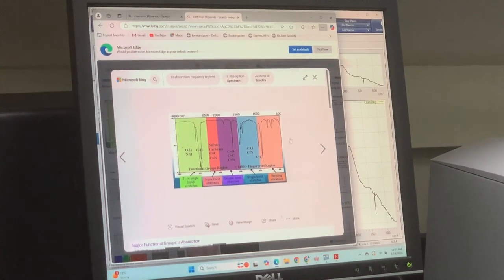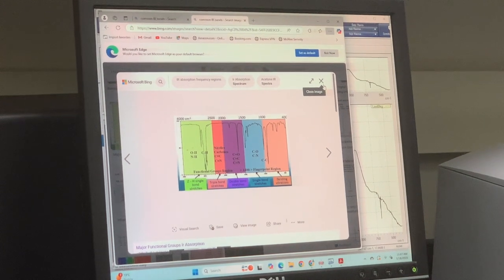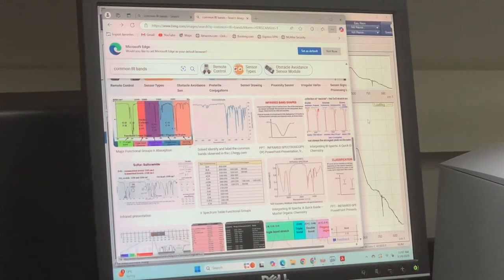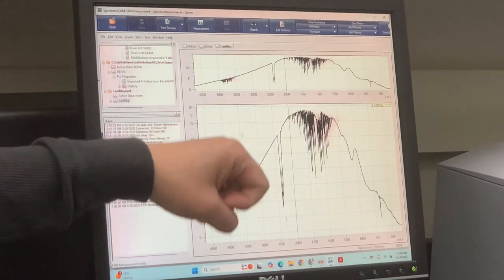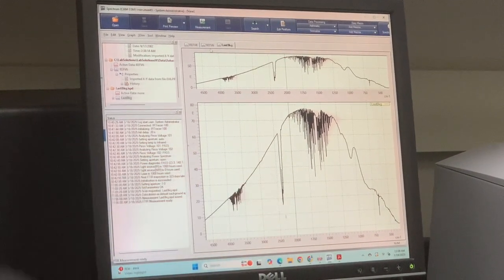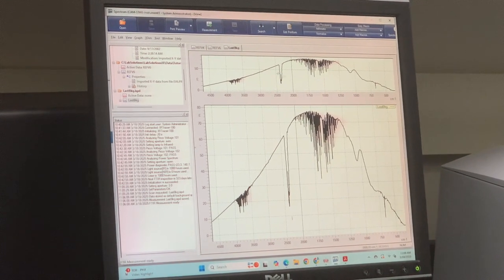Anyways, we're looking at a background scan. If we analyze this data, we can get that. Yeah, if you're looking at libraries. Okay, so can we apply the library here so that we can directly compare what we have measured with the library plot? Is there a function to do that? Not for the background scan, but in general, yes.